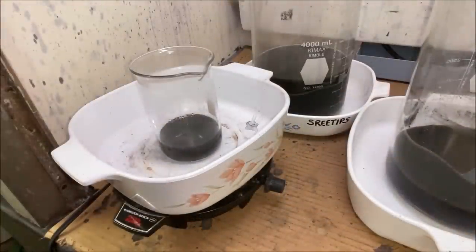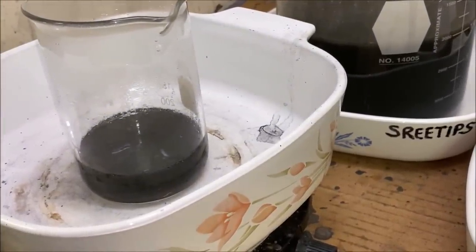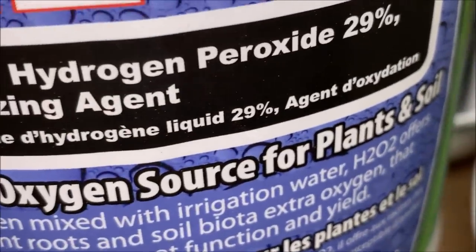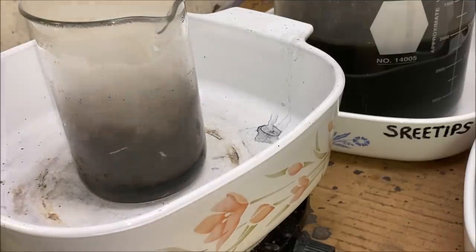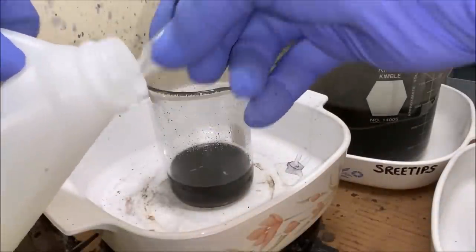I haven't added any heat yet, but I think I'm getting some kind of reaction going on in there. I'm going to add a little bit of hydrogen peroxide right now. 29% hydrogen peroxide. We're going to try to make some piranha solution, see if we can get some of this carbon off of here with this little amount that we got in this beaker. Here we go. I'm just going to add a little bit of the 29% hydrogen peroxide right on in. Whoa! There we go.